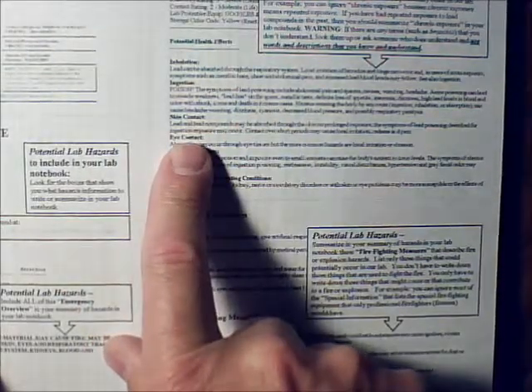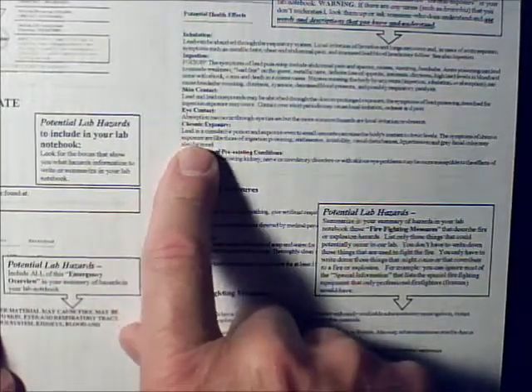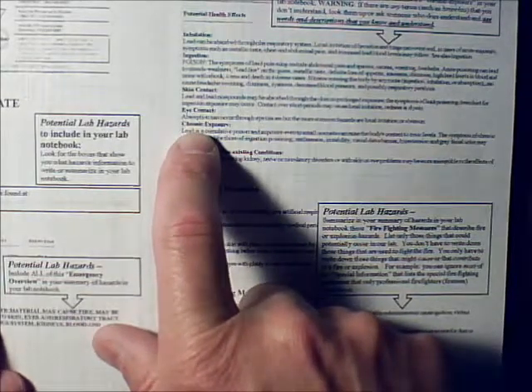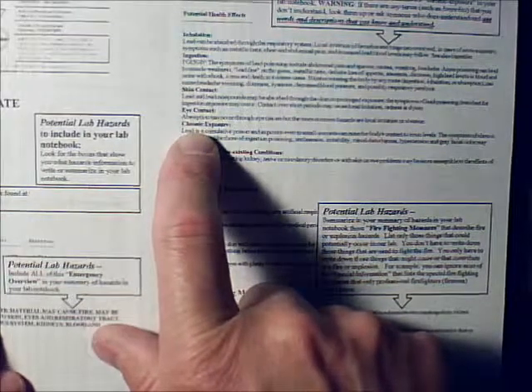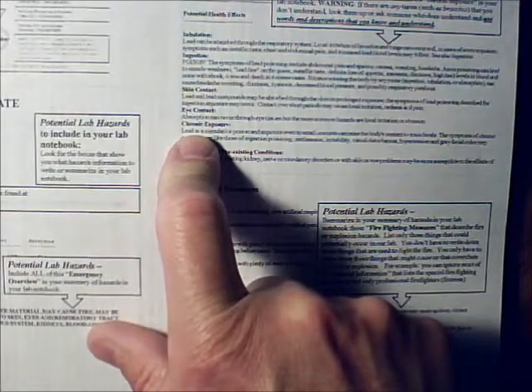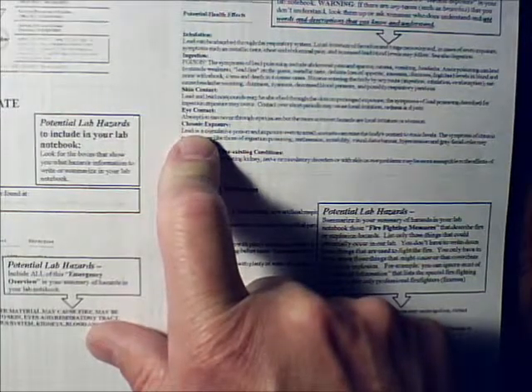Skin contact. Well, it's easy to get stuff on your skin, isn't it? Eye contact. Chronic exposure. Is that something that's going to happen in a lab? What does chronic mean? Not just every time, but it has to be over and over and every time. Overtime. You're absolutely right. Overtime is perfect.